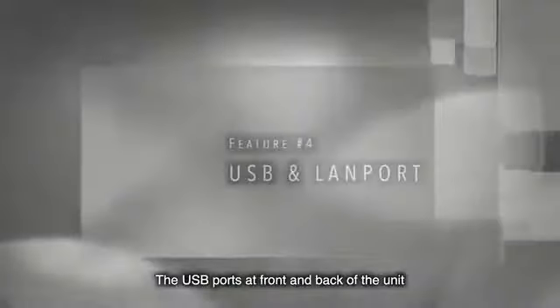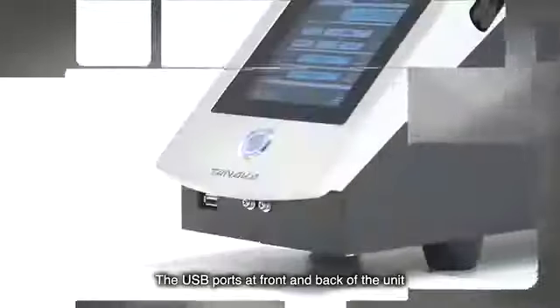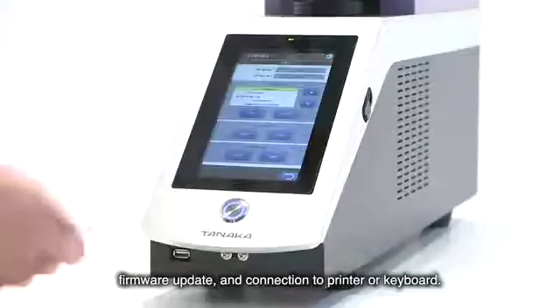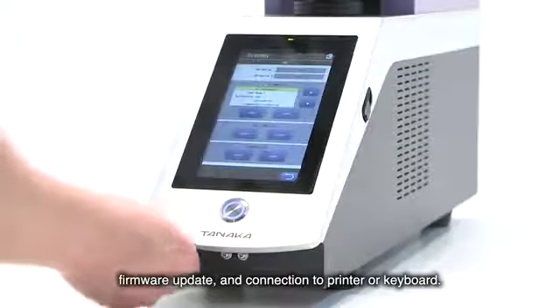The USB ports at front and back of the unit provide easy access for data export, firmware update, and connection to printer or keyboard.